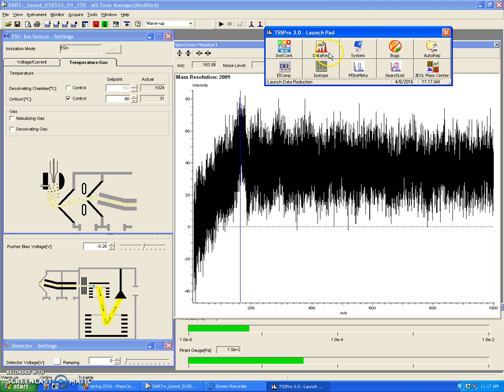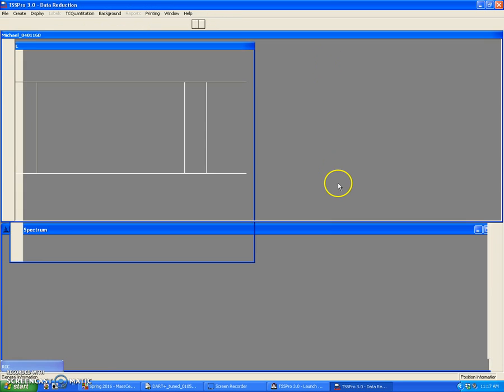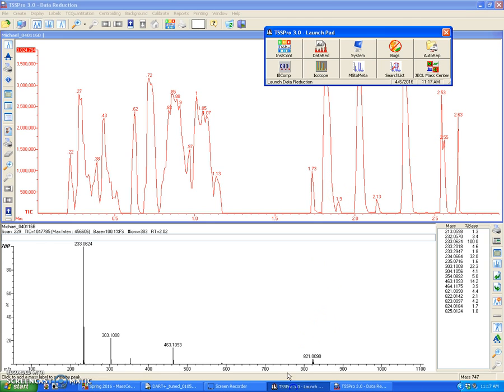And that will open this TSS Pro launchpad. What you're going to do is click on Data Reduction. In some cases that launchpad will remain open just because someone left it open, and that's fine. All you have to do is click on this button right here, but I like to close it out.